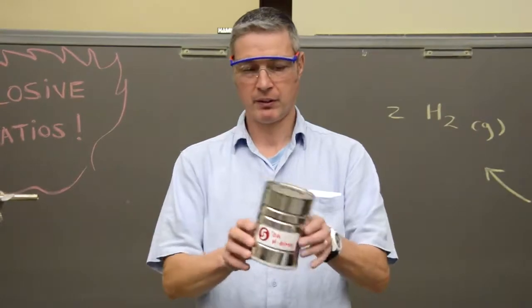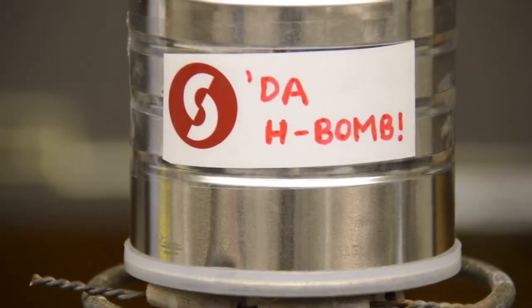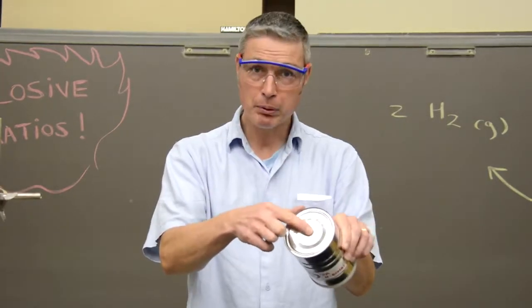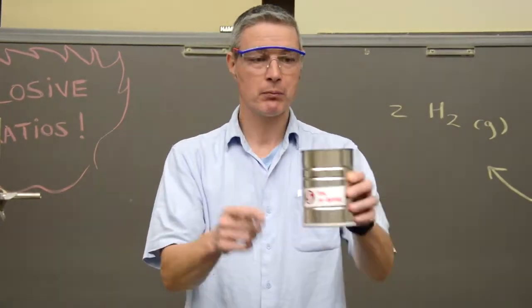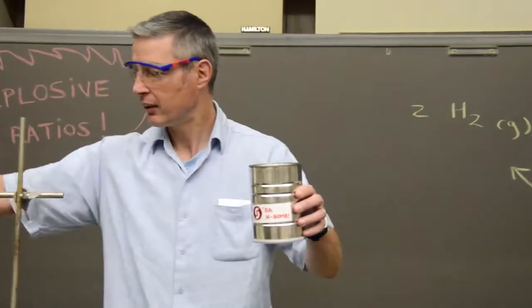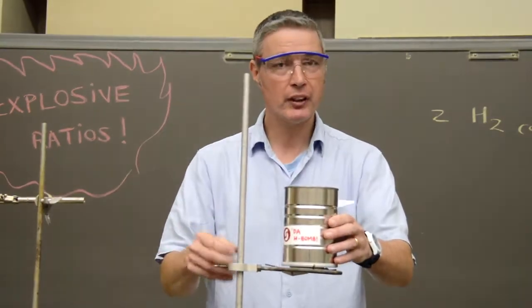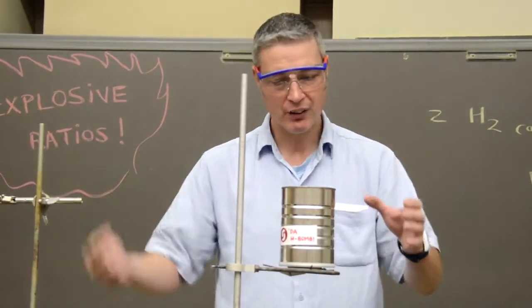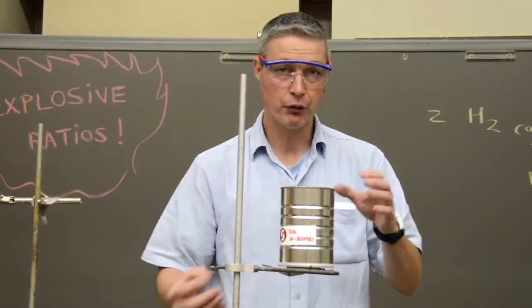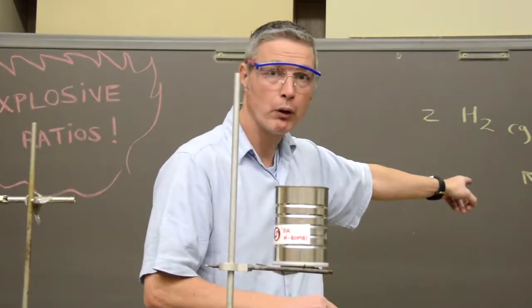Now we're going to get a little riskier. This is just a coffee can I decorated, but it's got a hole in the top, a hole in the bottom. We're going to fill it with hydrogen and then place it on this little pad. And what's going to happen is, as the flame burns, oxygen is going to come in through the bottom. It's going to burn, burn, and burn until two to one ratio.